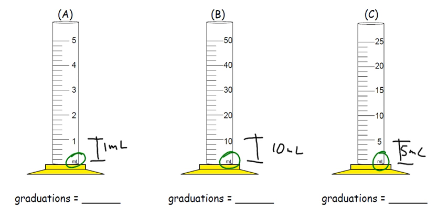That's the easy part. What can be a little more difficult is figuring out the distance between those two, and the distance between these two, and the distance between these two. There's one easy way to do it. Let's take the green pen here.